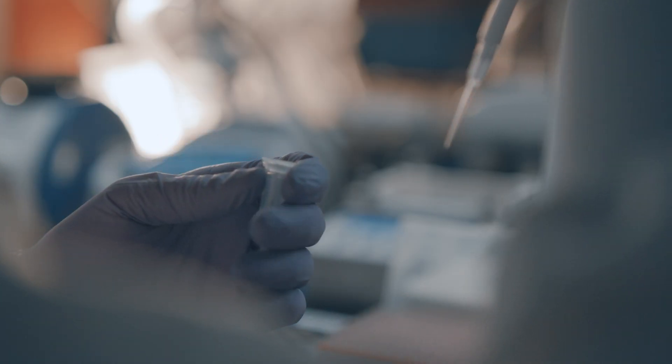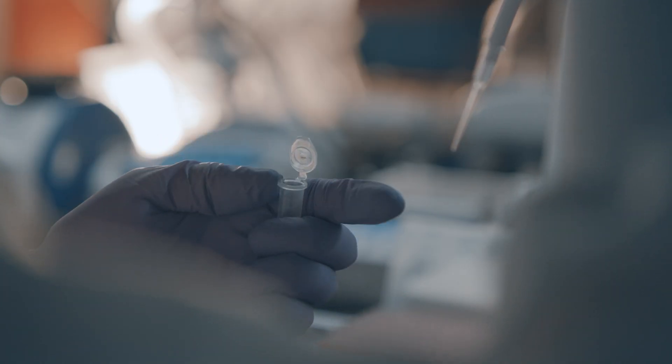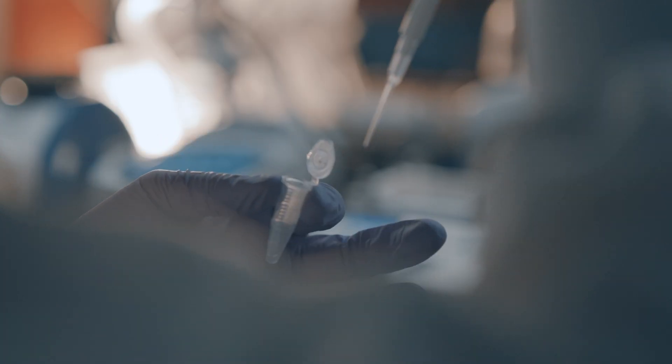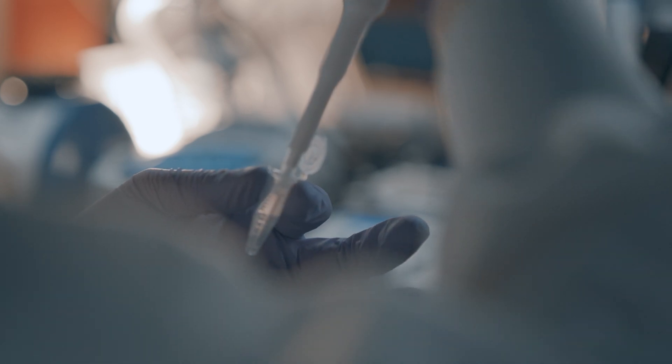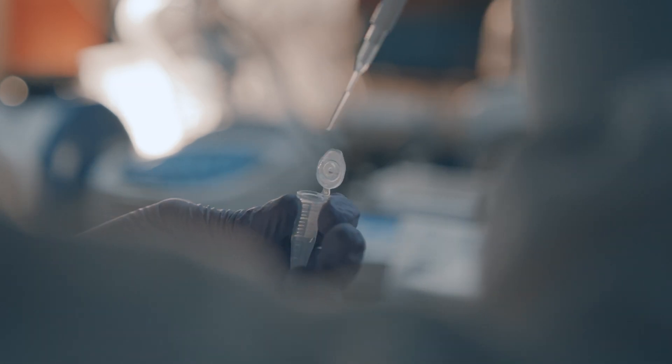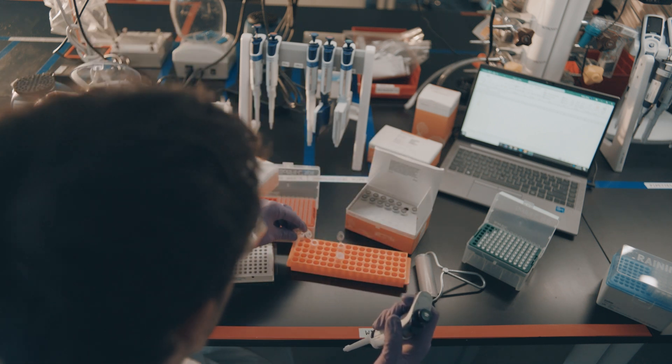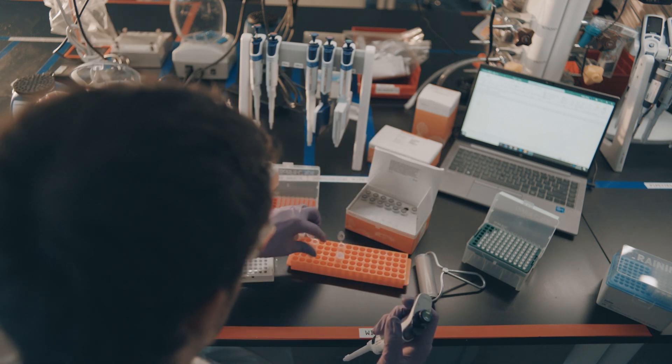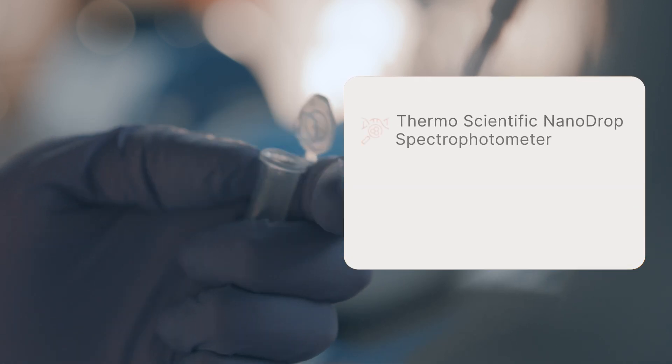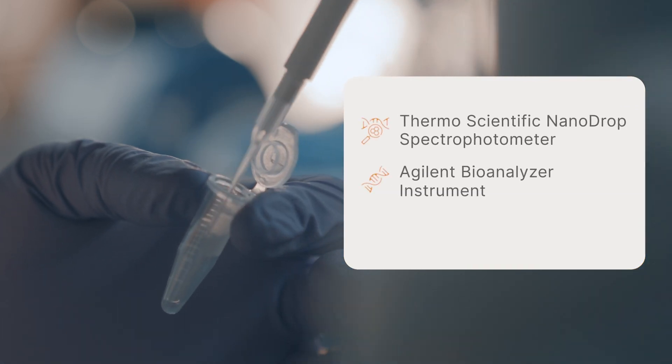Before executing the IMAP assay, users have a variety of options they can use for extracting their samples. At Illumina, we have tested several different Zymo research and Kiagen extraction kits and have seen robust results. Purity and quality of extracted nucleic acid can be assessed using the NanoDrop and or the bioanalyzer or tape station.